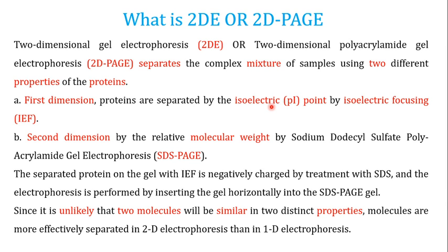So this is the power of 2DE, that it is very unlikely that two molecules or two proteins would be similar in both of the properties. Therefore 2D electrophoresis is very effective at separating the proteins from each other.